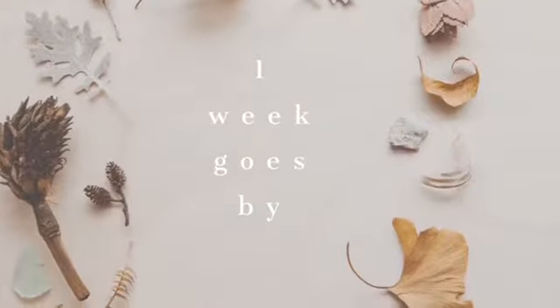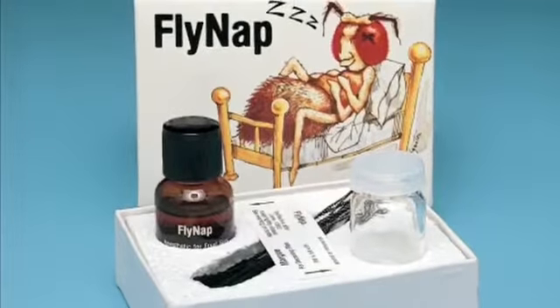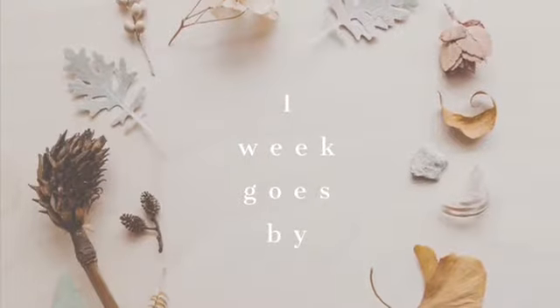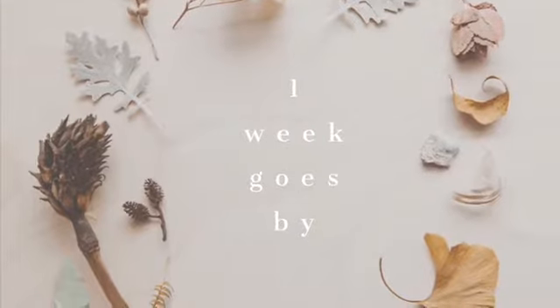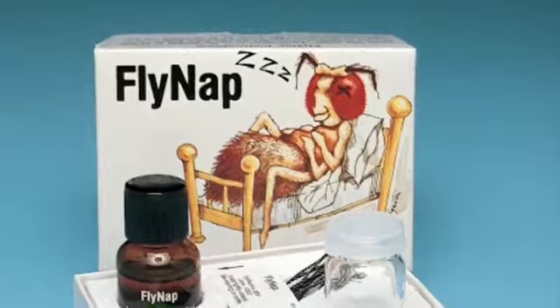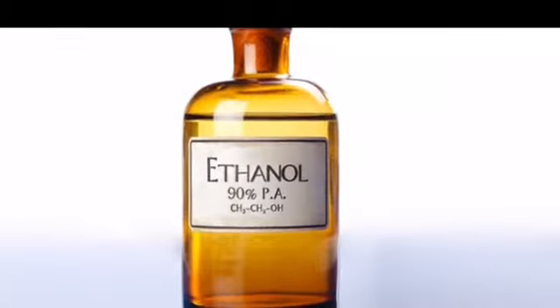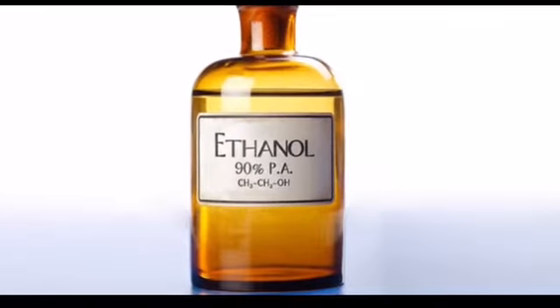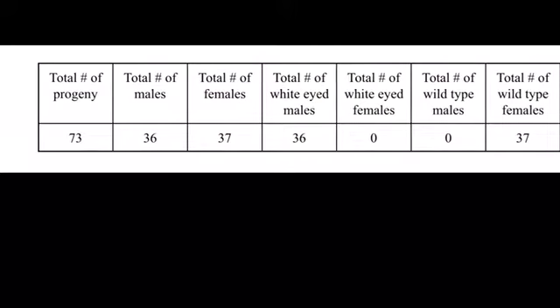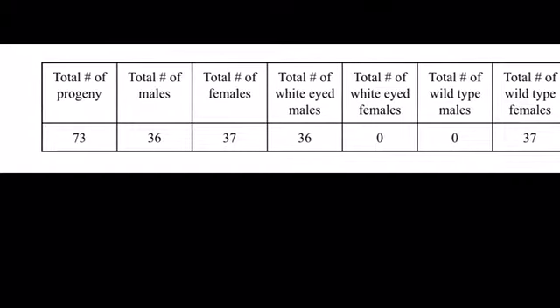After 1 week, FlyNap was administered to the F1 progeny parental flies so that they could be removed and only the larvae would remain. 1 week passed, and the FlyNap was then administered to the F2 progeny that was created in order for them to be easily handled and observed for their sex and phenotype. After the F2 progeny was observed and the results were recorded, the F2 progeny was properly disposed of in an ethanol bath.